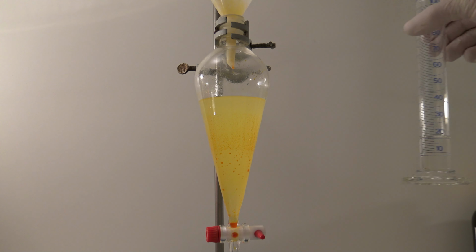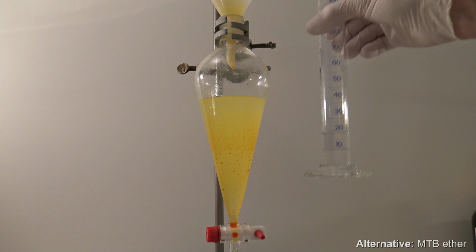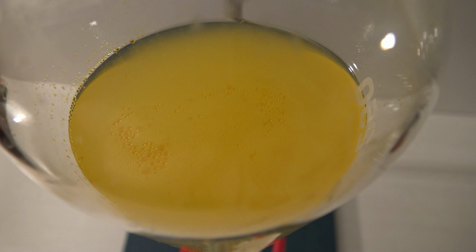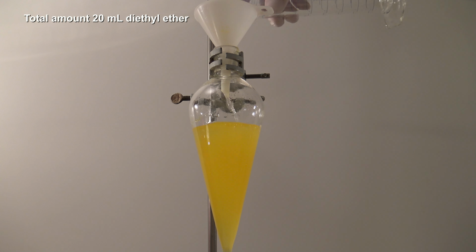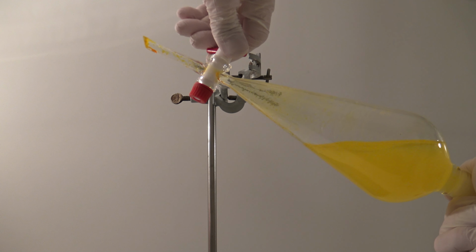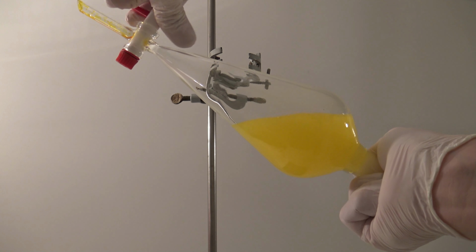As an alternative, MTB ether could be used. The amount was not mentioned in the source, so 10 ml were used at first. After shaking it, the layers did not separate very well. So another 10 ml of ether were added, leading to a total of 20 ml. When extracting with ether, it's important to equalize the pressure frequently. After some shaking, the pressure doesn't increase as much.